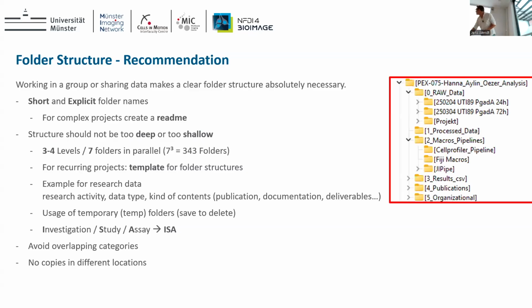For file names, here we have an example. This is what we did when we get a project for analysis. We thought we also need a common name, so they get a number and an internal prefix, so that every student coming with a project for analysis gets such a number. We are using eLab for this, to create this counter.